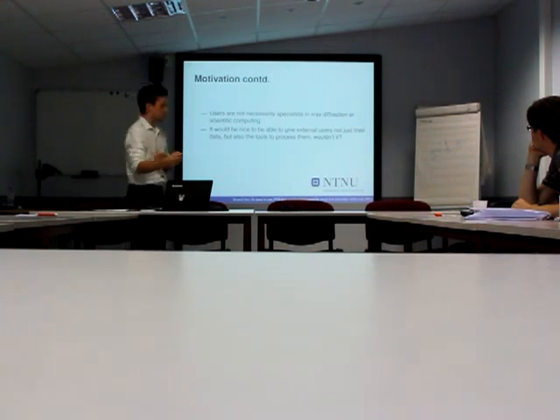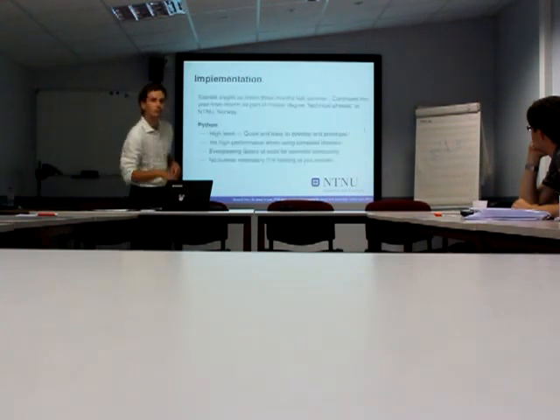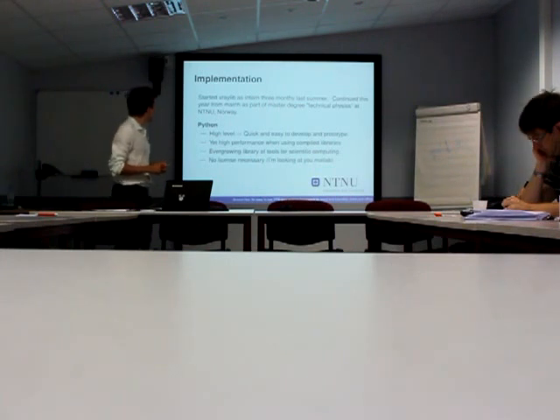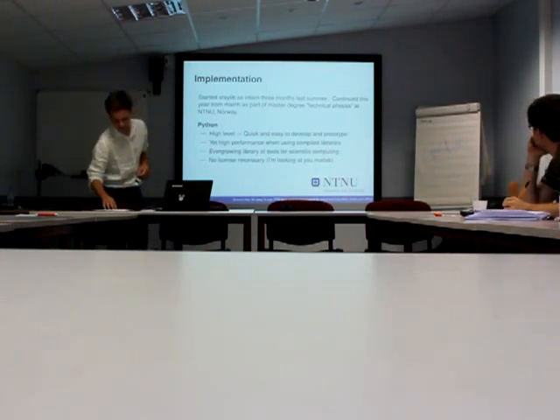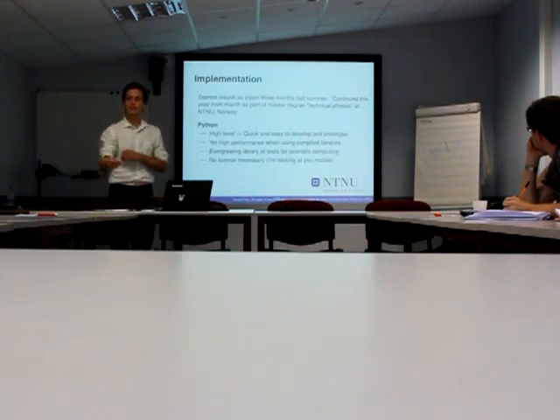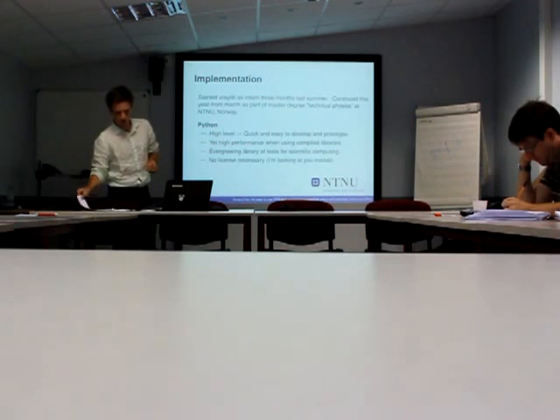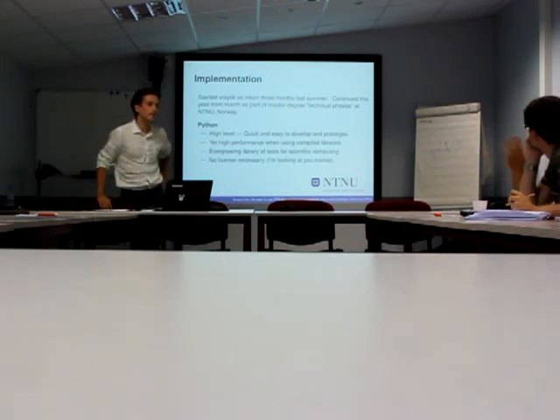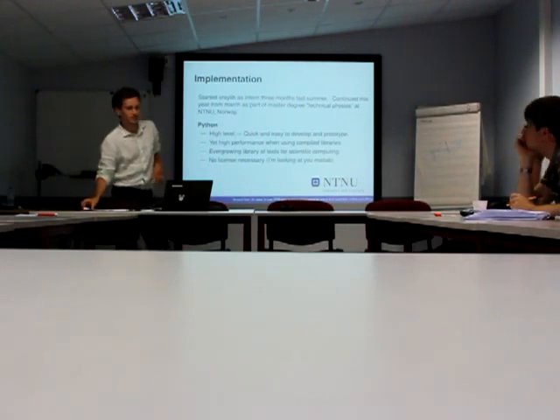So for this, he wanted me to make a software framework that could be built upon to make these tools. I started on this last summer with the detector calibration and azimuthal integrations. For those who know it, it's just the same name as the library for fluorescence data.